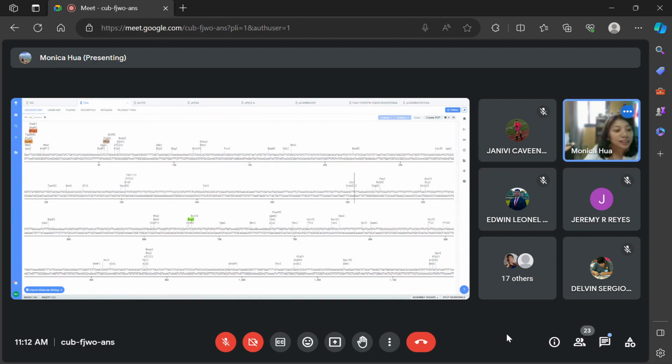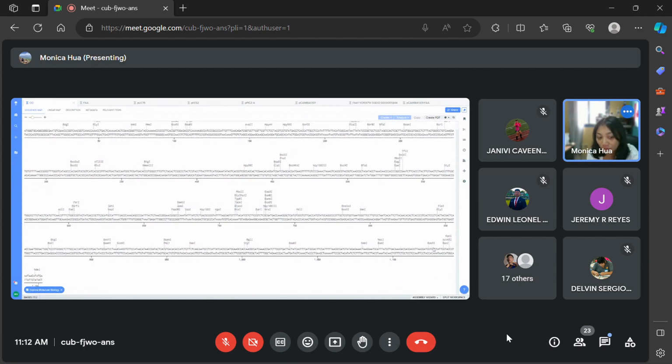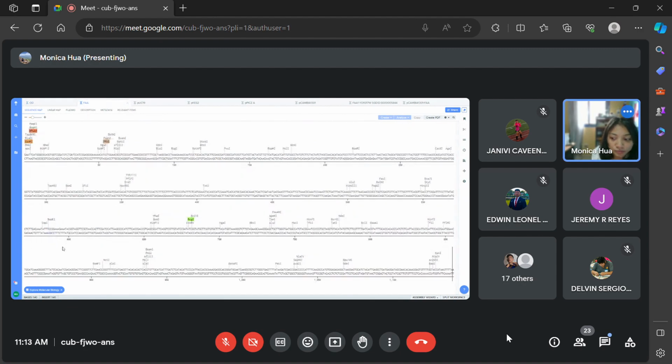All right. Okay. We ready? All right, guys. So after inserting that, that is your forward. You have to do the reverse. So you have to go behind your, for you guys, OD sequence. After TGA, you're going to insert this same cutting site, the restriction enzyme site. So do the same thing.